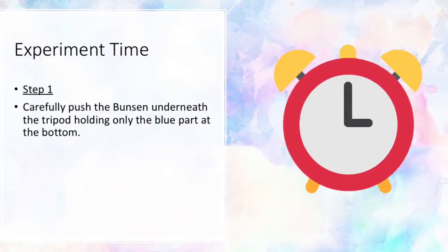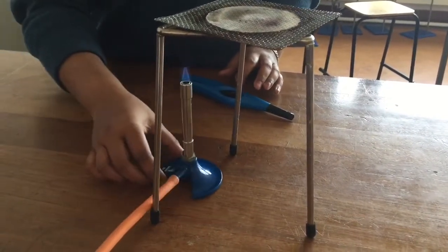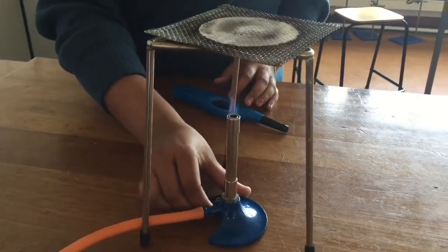Experiment time, step one: carefully push the Bunsen underneath the tripod, holding only the blue part at the bottom. Step two: place your wire gauze on top of the tripod and fill your glass beaker with 100 ml of water.